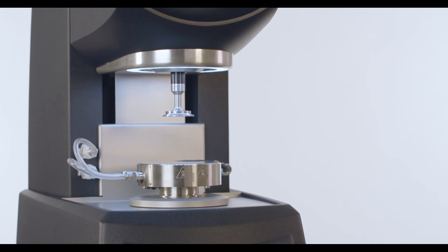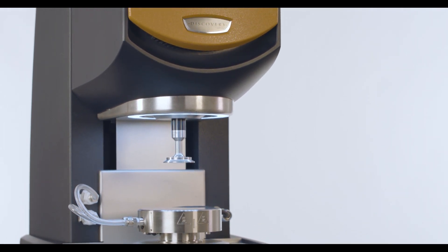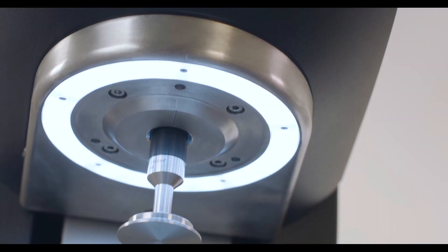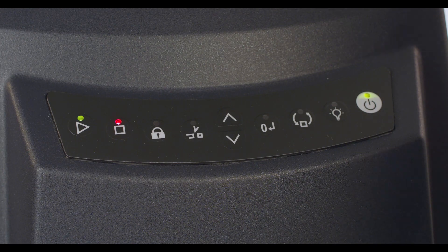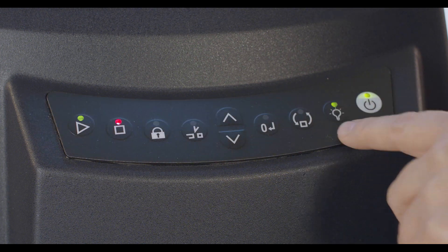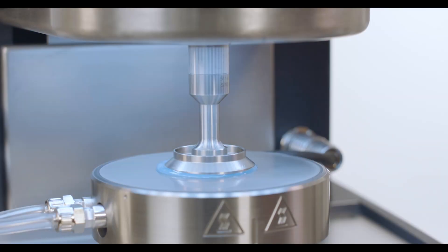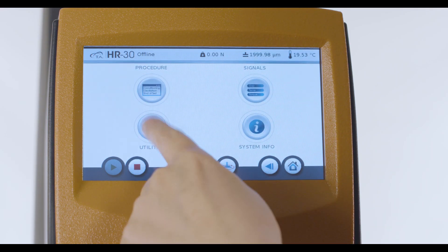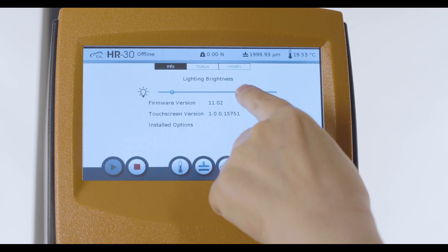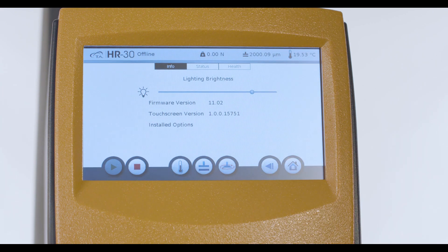The Discovery Hybrid Rheometer has a built-in LED light under the instrument head front panel that is used to assist with sample loading, trimming, and verification. From the instrument front panel, press this button to turn on the LED light. You can also adjust the lighting brightness to your comfort level from the touch screen under the utilities page.